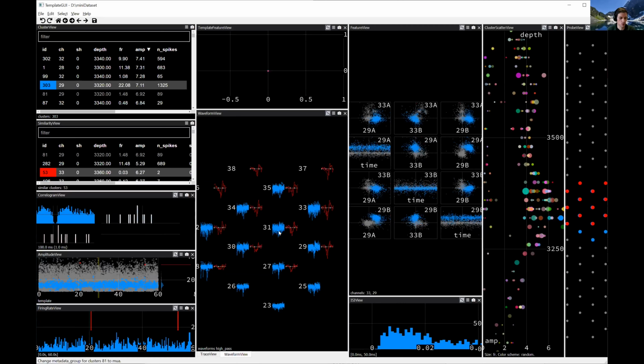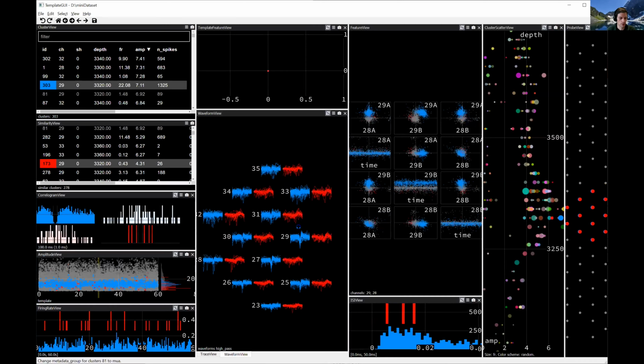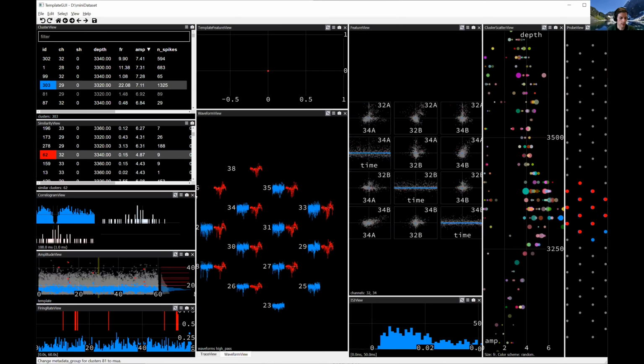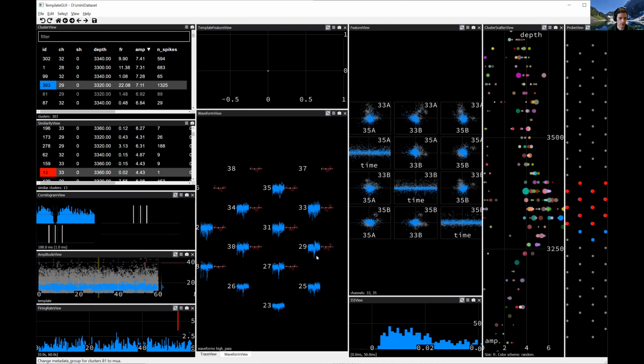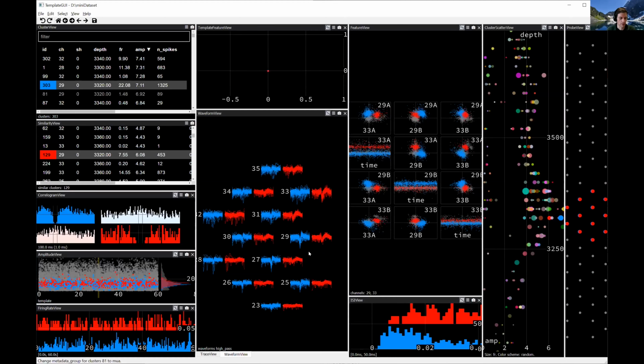and go on later. Okay, so then I can skip through a bunch of these and see whether there's any that need merging. At some point, they start to get less and less similar to the one I'm considering. And at that point, I say, okay, I must have looked at all the very similar ones to my blue unit, and there's nothing remaining. So now it's time to make a decision about the blue unit.